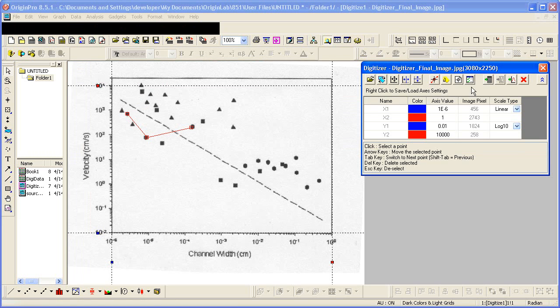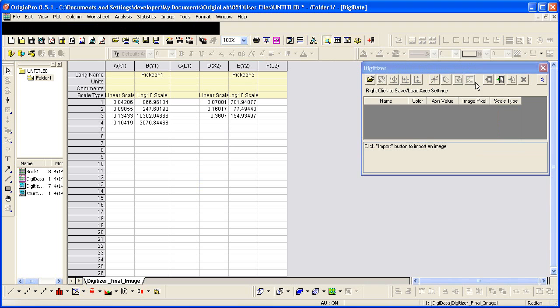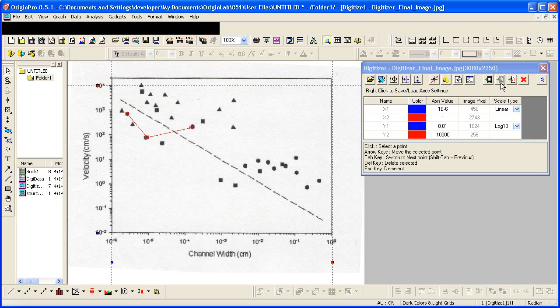And then if I look at the data, I have a new set of XY data. We can go back to the image and we can continue.